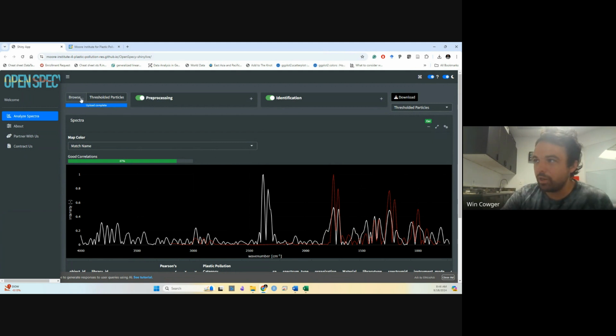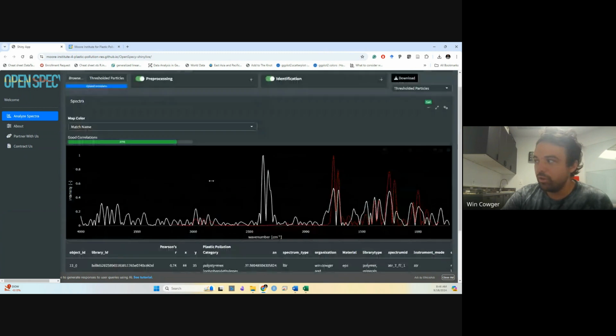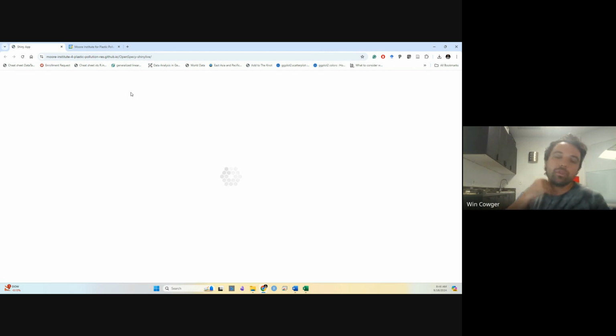When I uploaded a single spectrum, the map information should have disappeared, but it's still using the map information. So we need to do some refreshing or something. Let me just refresh here, and then I'll upload that thresholded particle.